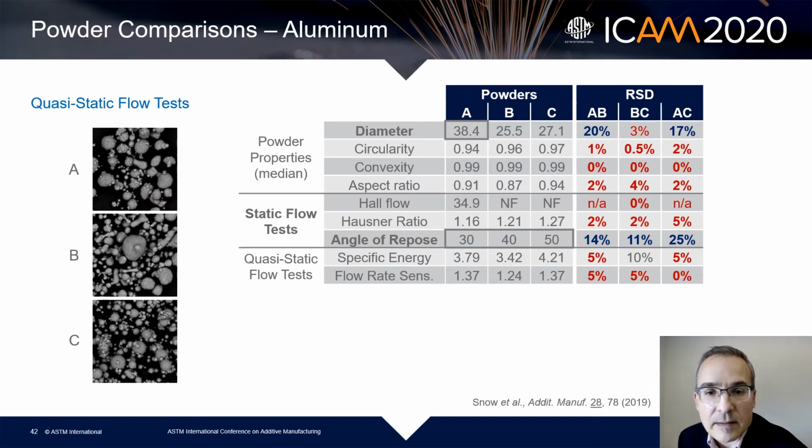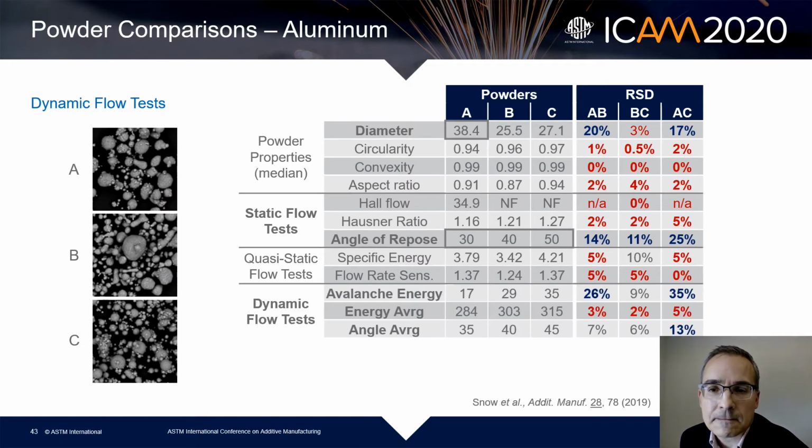Again, they tested the Freeman FT4, I believe, and found little variation in that data. And then they tested with the Mercury Scientific Revolution again, and for 2 of the 3 parameters saw some pretty substantial differences in the properties of those powders.